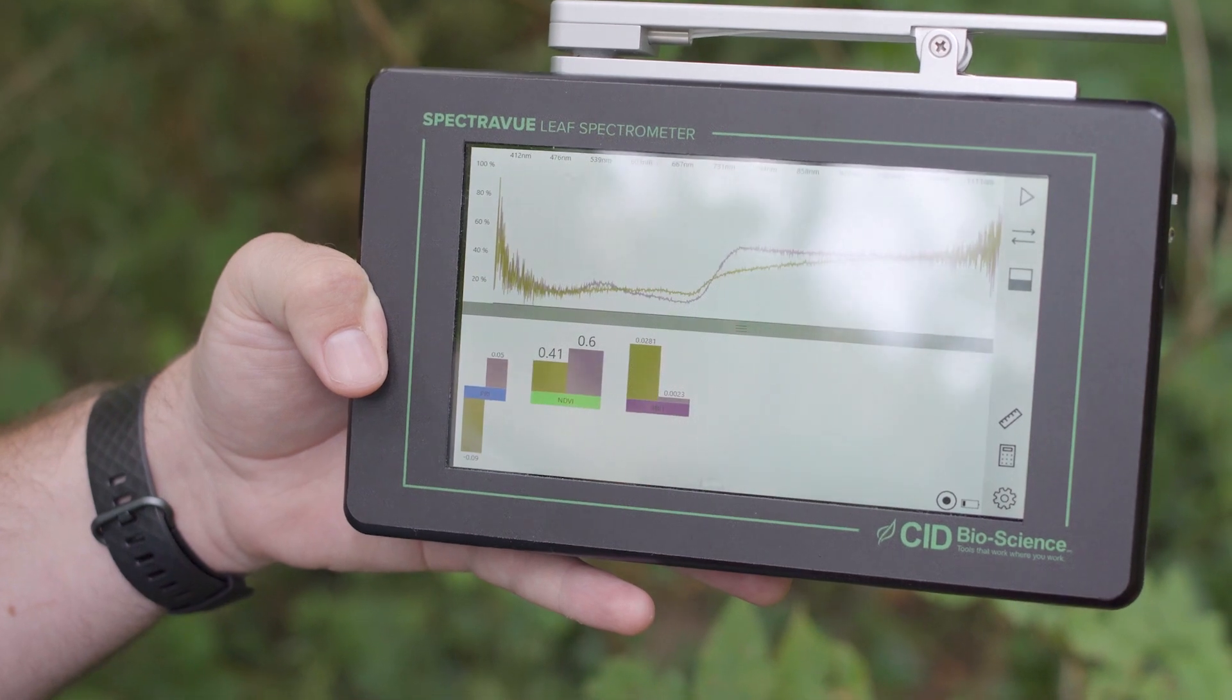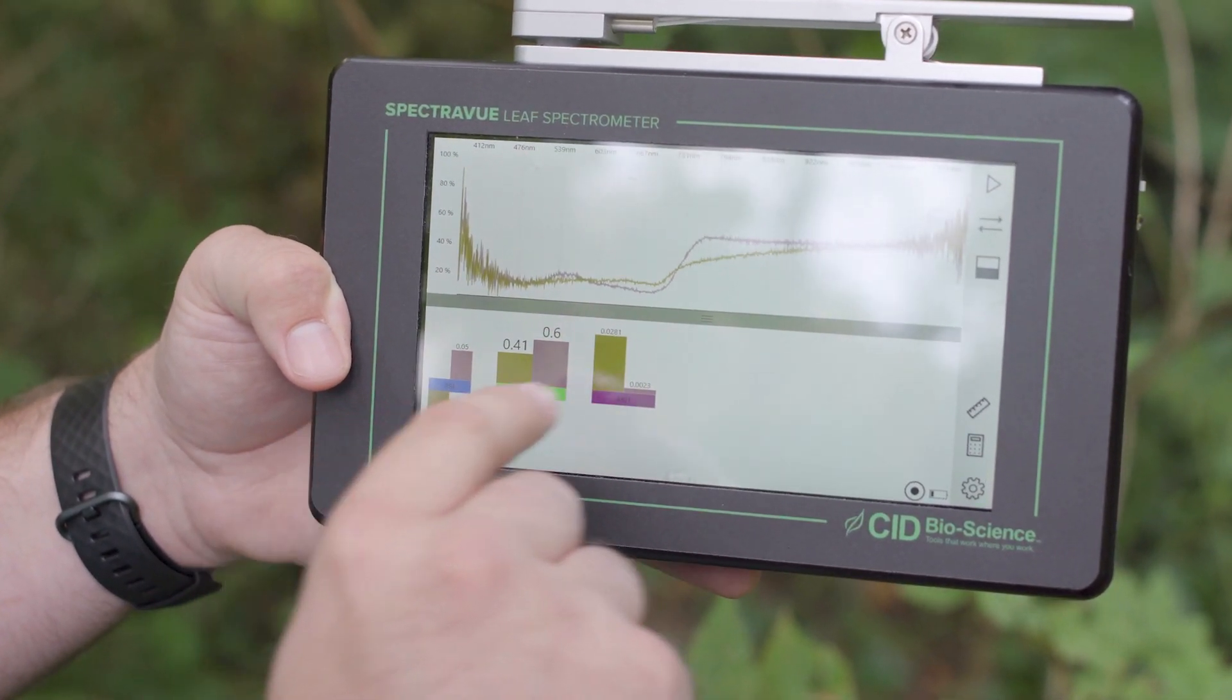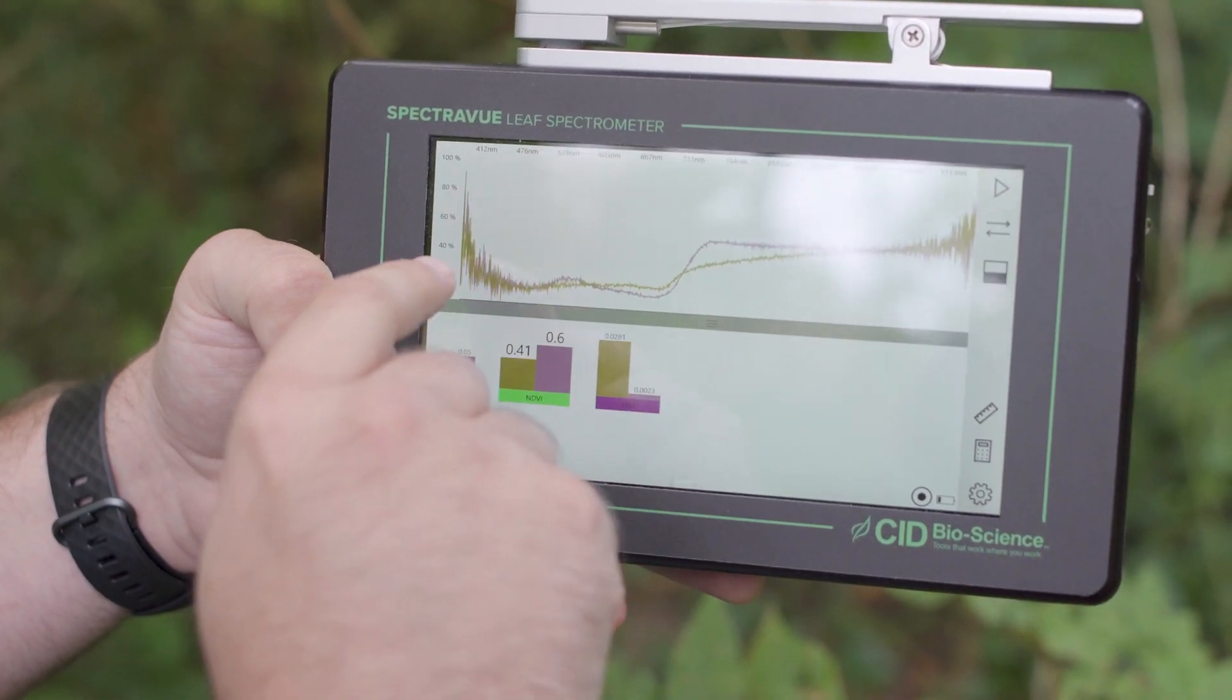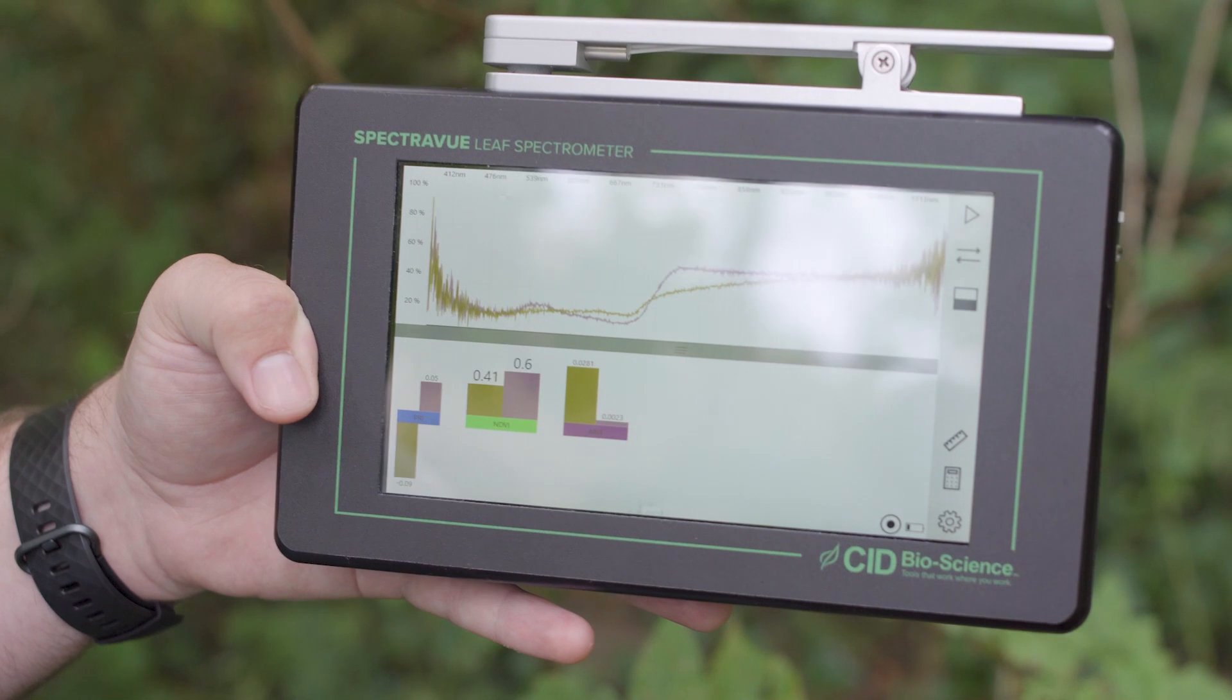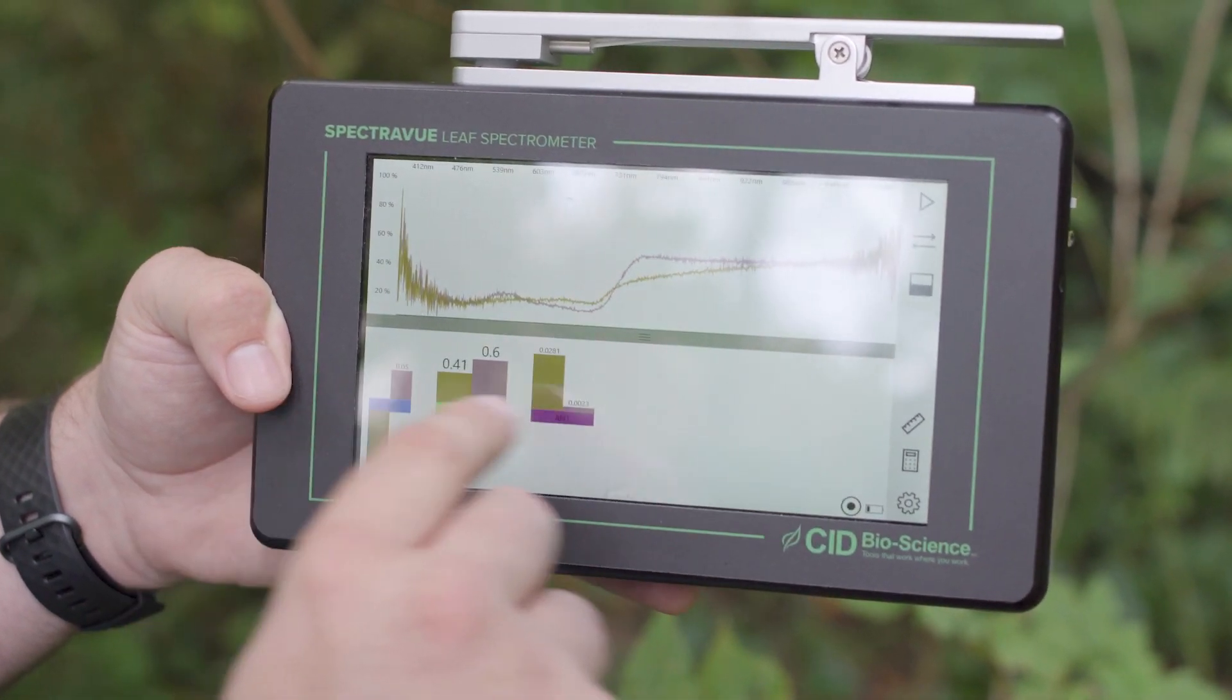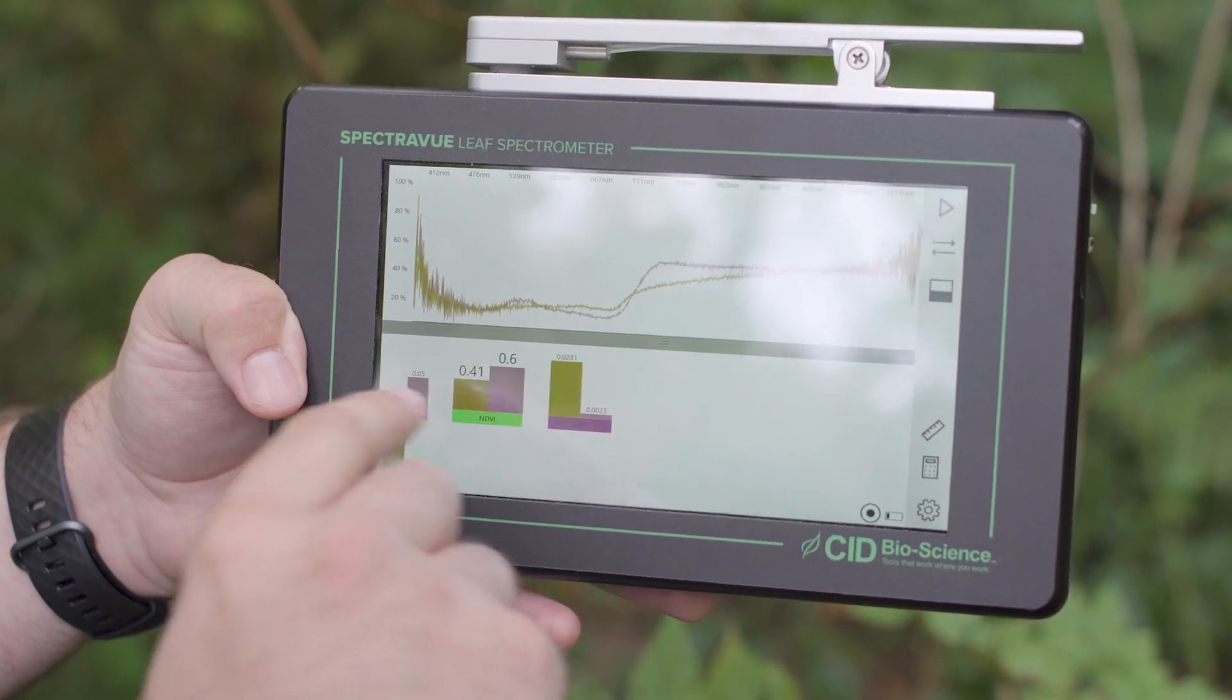The unhealthy leaf is represented by the goldish green bars here down in our indices, and then also by the goldish green line in our spectrograph. These numbers down here indicate the values for each of these pre-selected indices.